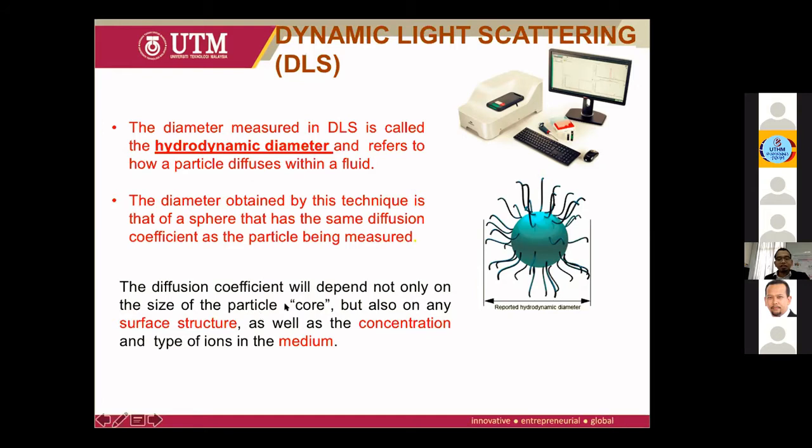Take note that this hydrodynamic diameter is usually highly dependent on the surface structures, the concentration and the medium of your samples. So the preparation of the sample in the solution that we are going to measure is really important. That's why when you send your sample to any analysis institute, make sure you know the intended size range, having already done a few works in analyzing the sample. Let's say you have done your XRD or your TEM, you know the approximate size, then you can send it to the research center, or else the result they give you will not tally, and might confuse you later.